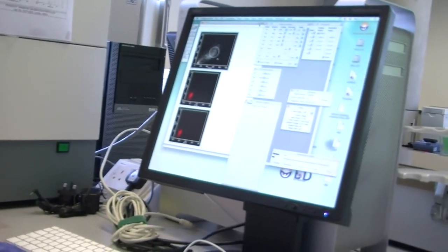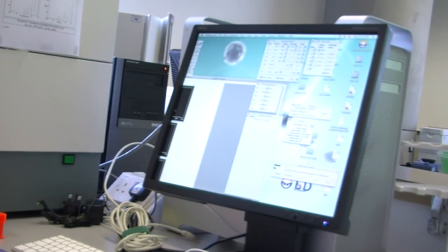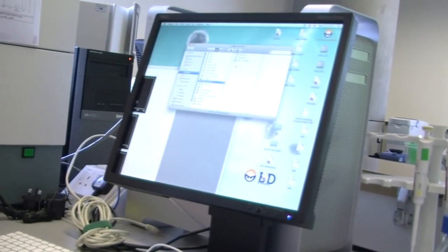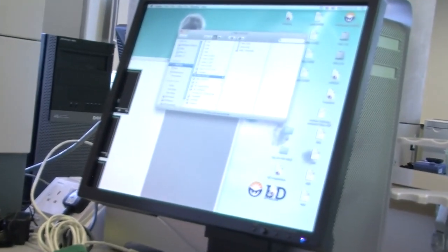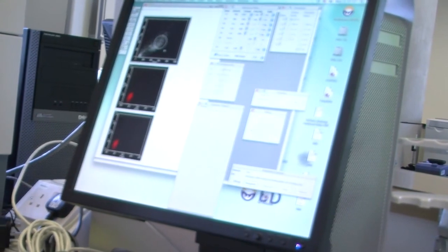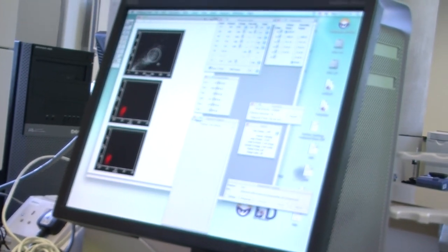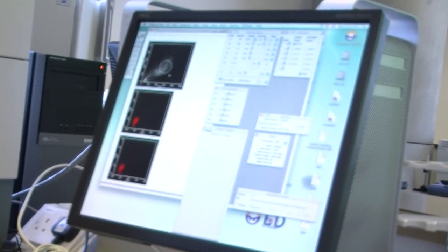So it's now gone back to the acquire button. If I bring up today's folder I made, we've got data 1 and data 2 in there, which is good because we've run 2 files. So then we put on number 3. And again, when I said about pattern recognition, about looking at shapes, what you want to be looking at is the forward and side scatter shapes.